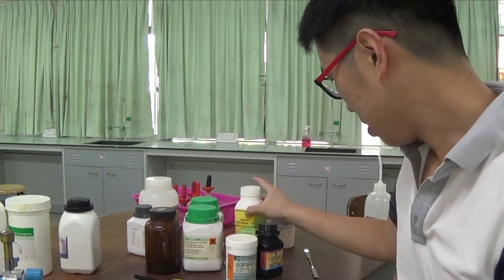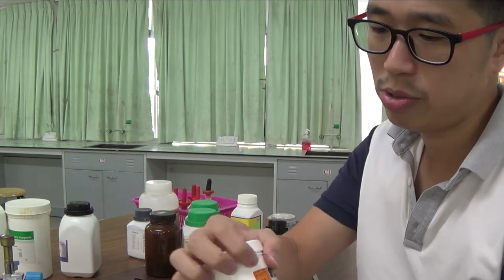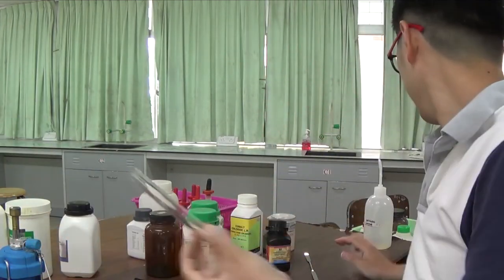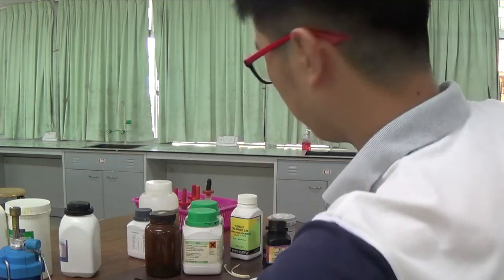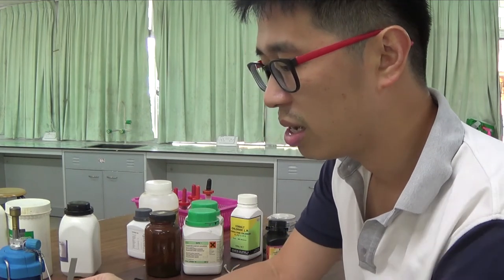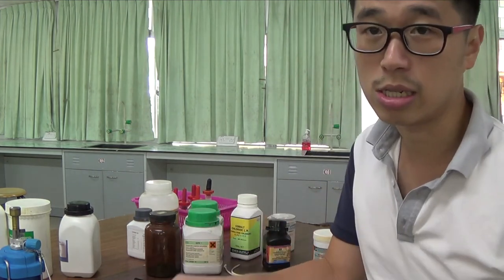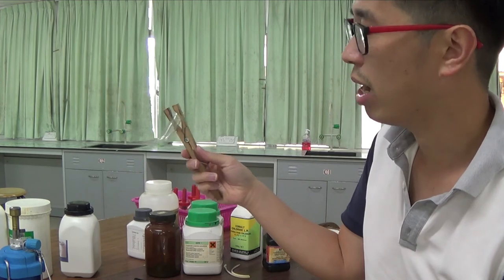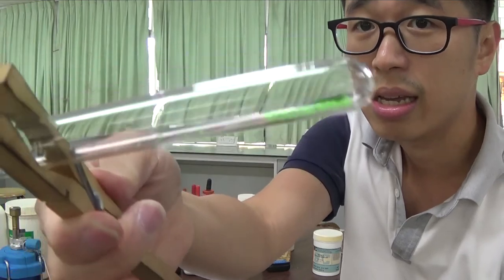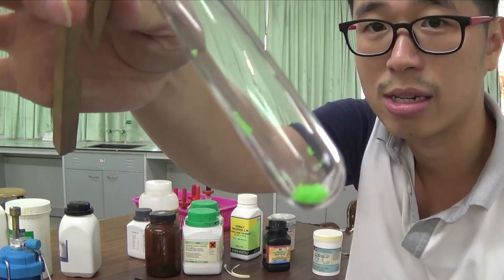Okay. I'll just show you one more perhaps. Nickel 2 chloride. So nickel 2 chloride was this beautiful green color. Alright. So I'll scoop out a little bit of it. Let's use the spatula. So this tutorial is not about testing for the cations or the anions. It's about showing you the water of crystallization present, as well as what kind of observations to make when you're asked to heat a solid, right? This is a solid. The test tube is dry. It doesn't stick on the test tube at all. It is a green color solid. It's a light green solid.